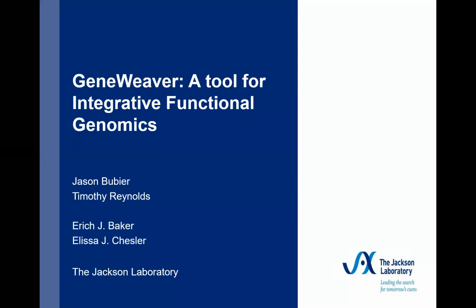I want to share with you all about GeneWeaver. We'll provide an overview of GeneWeaver and how it's set up conceptually, how it's organized, what some of its applications are. I'll talk about some of the emerging tools that we've been releasing and developing, and I will also provide information on how you can do a demonstration exercise on your own using the website so that you can become familiar with all of its functionality as you go.